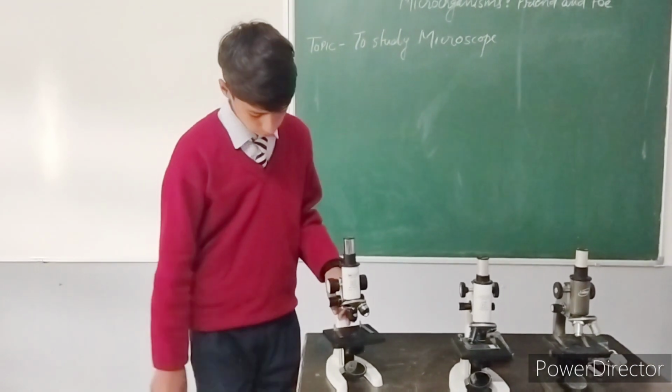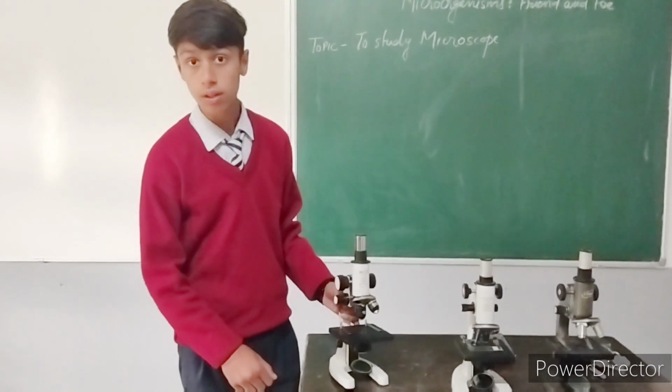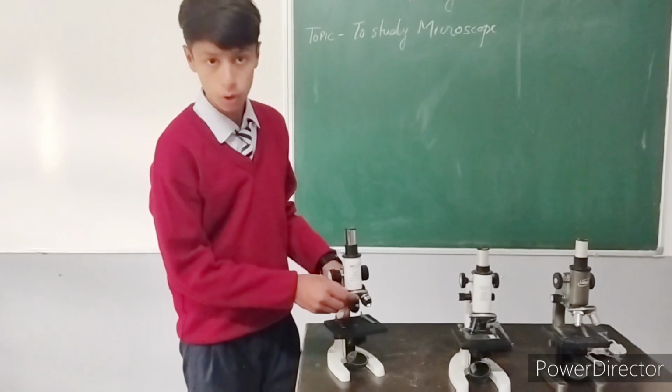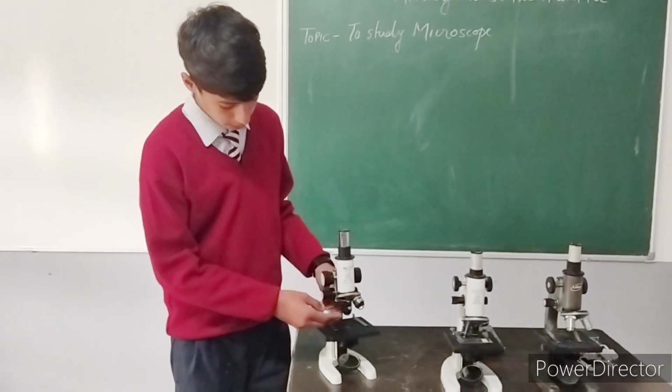It is. One thing is left out, the lenses. Ma'am, these are the objective lenses by which we can see the slide.